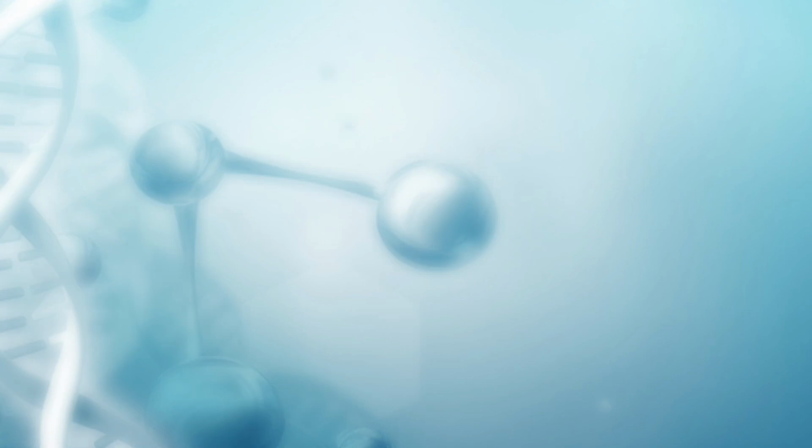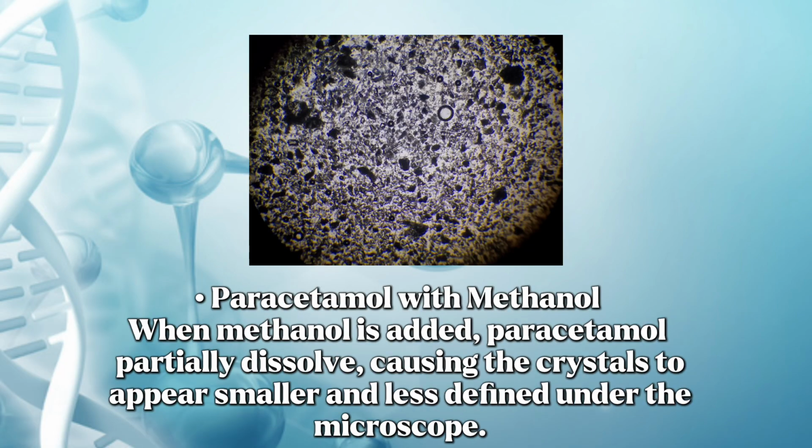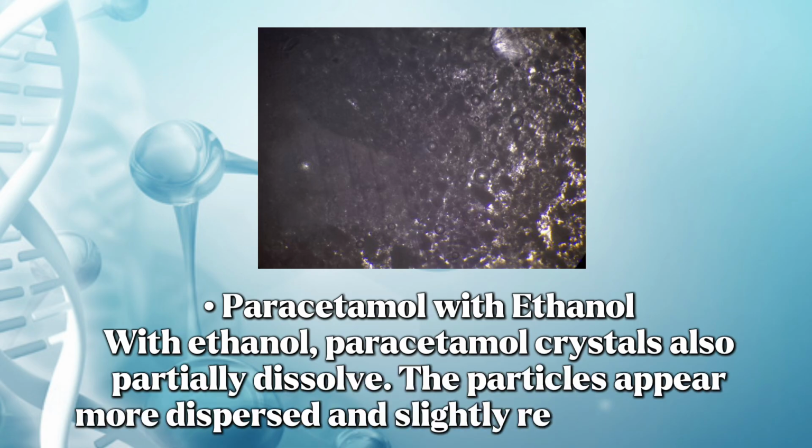Paracetamol with methanol appears partially dissolved, causing the crystals to appear smaller and less defined under the microscope. Paracetamol with ethanol. Paracetamol crystals also partially dissolve. The particles appear more dispersed and slightly reduced in size.